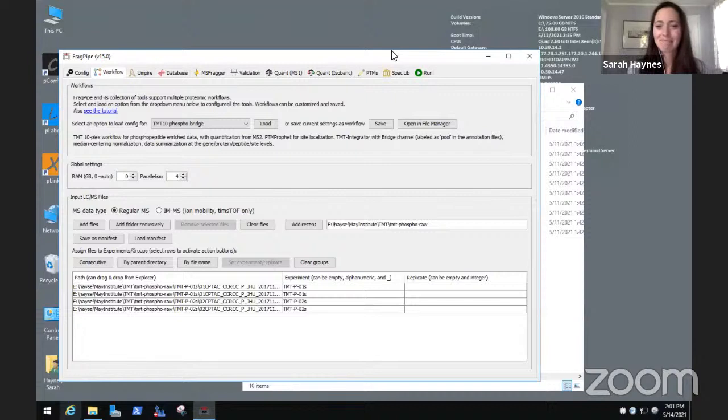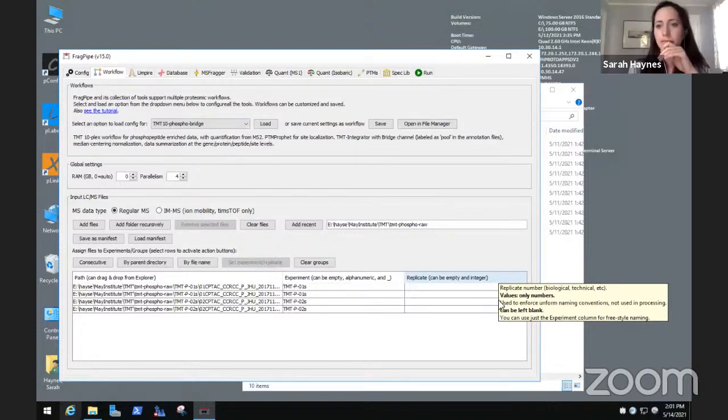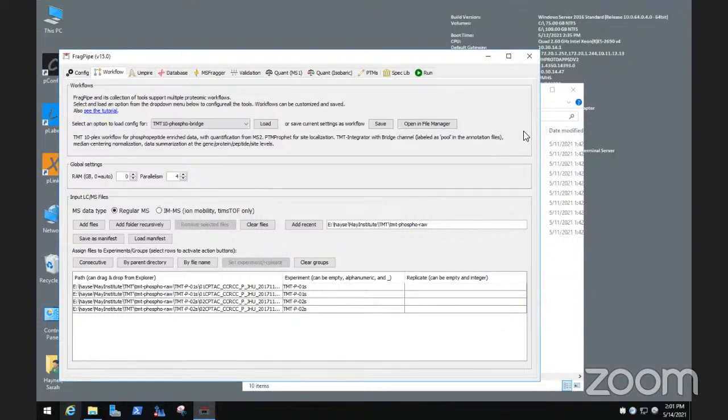There is a question about custom isobaric tags and how they interact with TMT. You have to mail us and we have to add it to Philosopher, because we need to tell Philosopher which one to extract. No, it's not possible for you to add custom tags. It's not a big deal for us to add another option. The TMT 16, TMT 26, 128, whatever is going to be there.